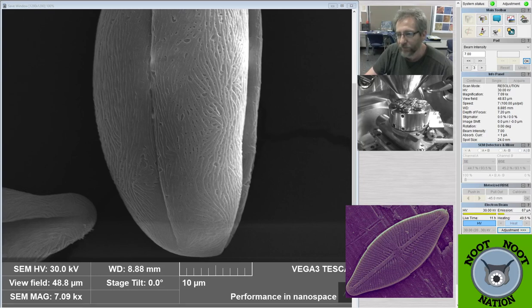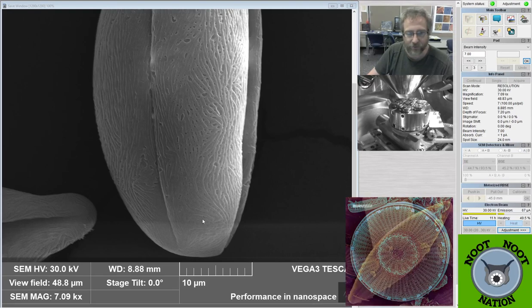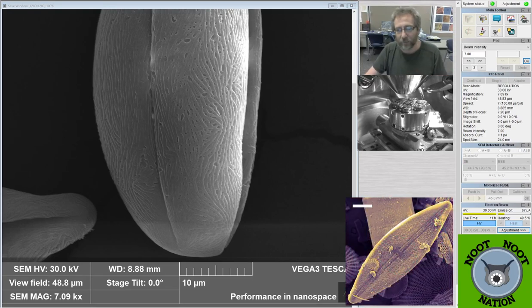Yeah. The carbon tape, and then also it's got a negative ground. This whole thing is grounded, obviously, so it pulls the charge out of the material. But this one actually does have some bright and dark spots on it as a result of that.